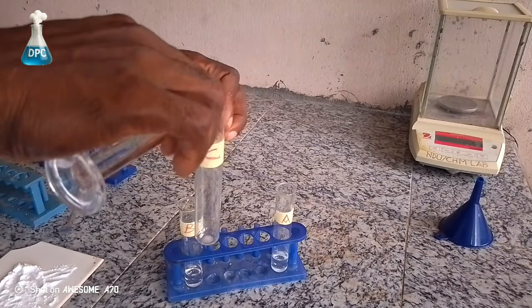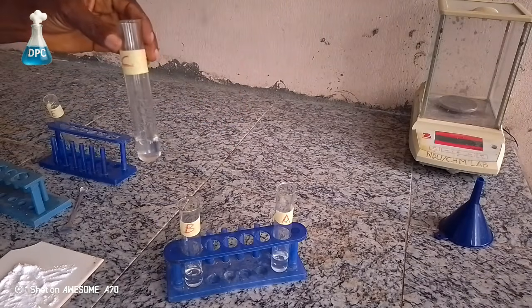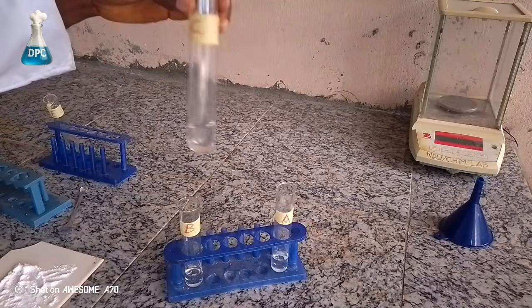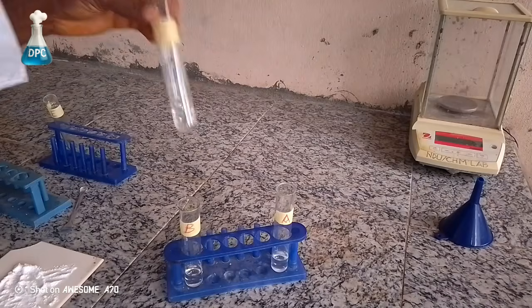Now that is test tube C with half a spatula of sodium hydrogen carbonate. 10 ml of water is added. Ensure that all sodium hydrogen carbonate is completely dissolved.